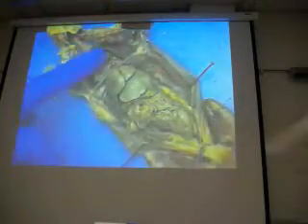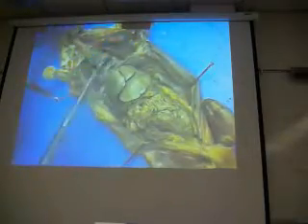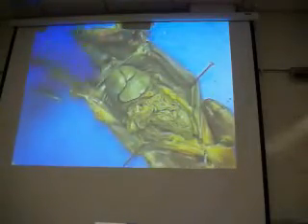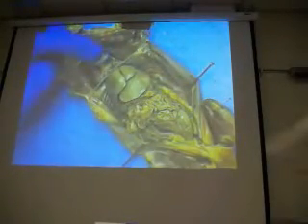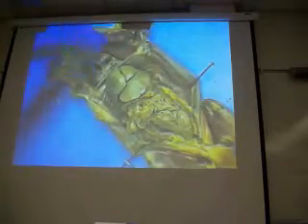So here you can see the abdominal cavity right here, right? And what separates the abdominal cavity and the thoracic cavity from each other is the diaphragm. But the other thing, when you're in the thoracic cavity, you have a couple other little cavities right here. You have the pericardial cavity where the heart is situated, right? And then you got the pleural cavity where the lungs are actually situated, okay?